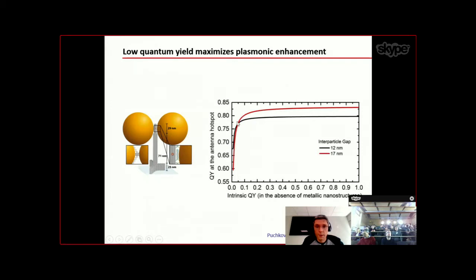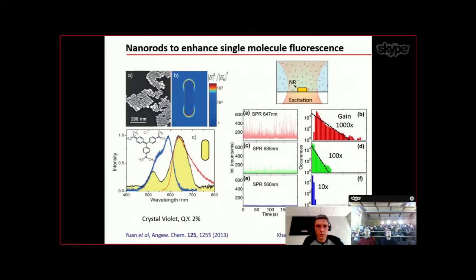All right, so that's the beauty of the nanophotonics enhancement of the decay rates, that you can increase the fluorescence, the quantum yield, a lot in these terms, which is going to be very interesting because it's going to lower the background also. So you maximize the information from your hotspot, and at the same time you minimize the contribution coming from the top.